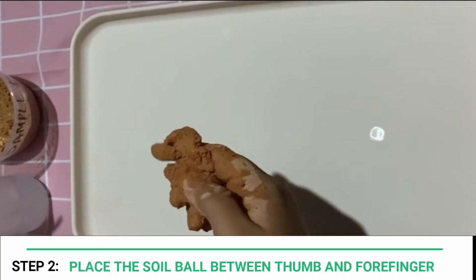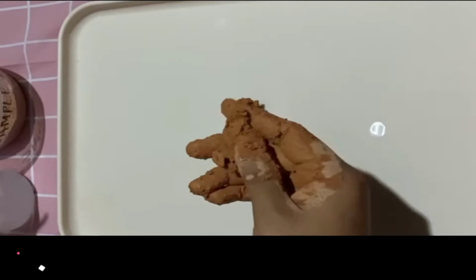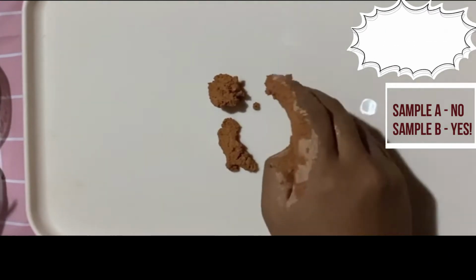Gently push the soil with the thumb with the same pressure and work it upward to form a ribbon of uniform thickness and width. Allow the ribbon to emerge and extend over the forefinger, breaking from its own weight. Does the soil form a ribbon?